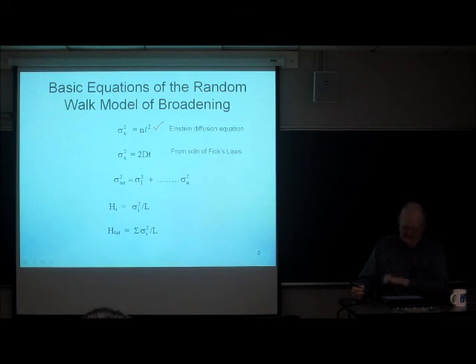No, the time before last. We'll also need this third equation that says if we have more than one source of broadening, one source of peak variance, then the total variance is the unweighted sum of the individual variances. And if we have n, then it's the sum of all n variances. And I say unweighted, the weighting coefficient is 1. They're all equally weighted.